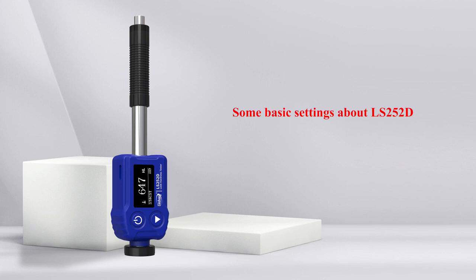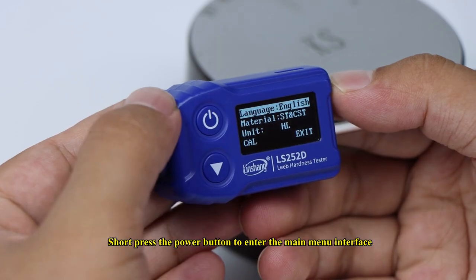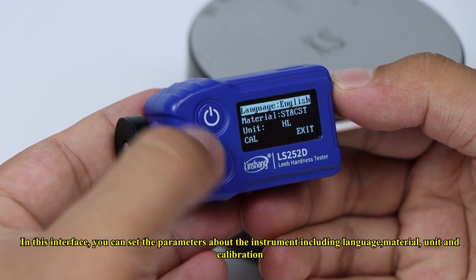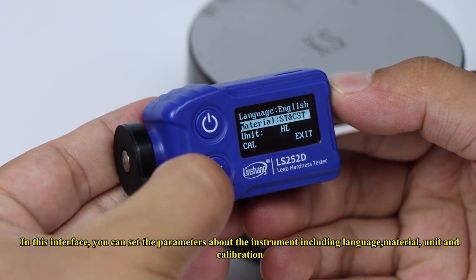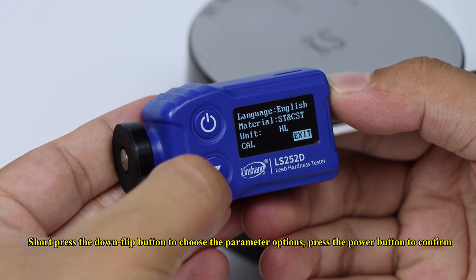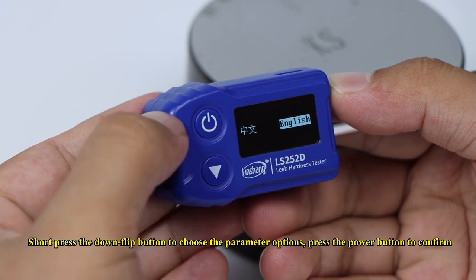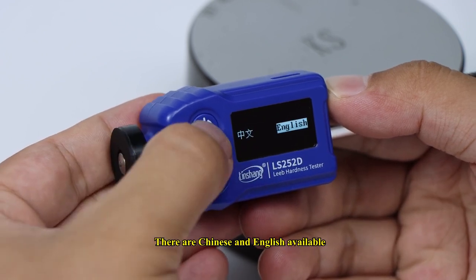For basic settings on the LS252D, short press the power button to enter the main menu interface. Here you can set parameters including language, material, unit, and calibration. Short press the down flip button to choose parameter options, then press the power button to confirm. Both Chinese and English languages are available.